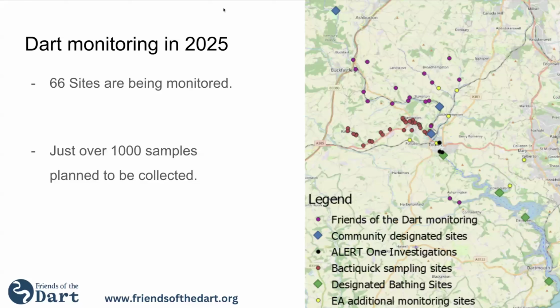So I know there was the phase 1 testing, and it was all very new. I know there were a couple of issues in terms of communication with the lab and samples. If you're looking at setting up this sort of thing, it's making sure that you get advice on that, because the samples were saturating at 1,000 CFU and the lab wasn't running later dilution.